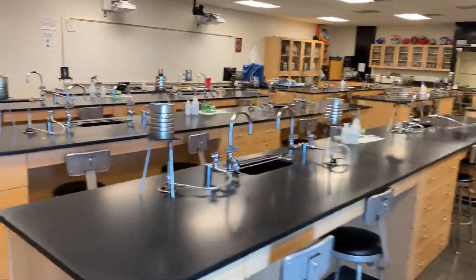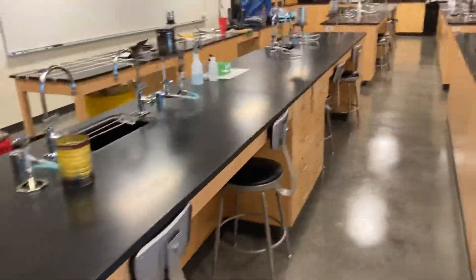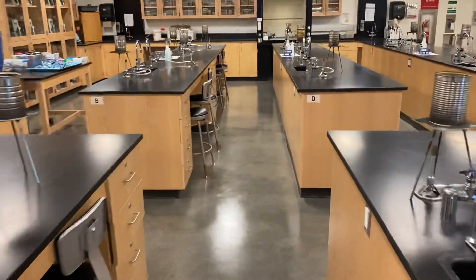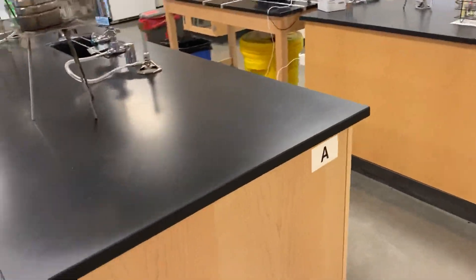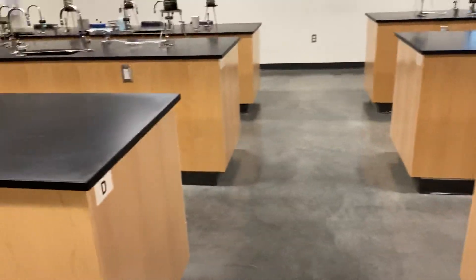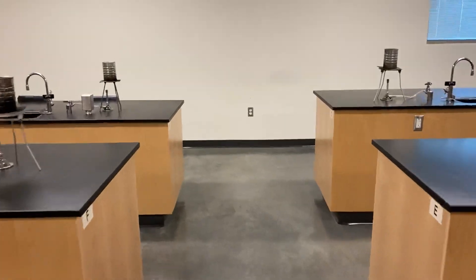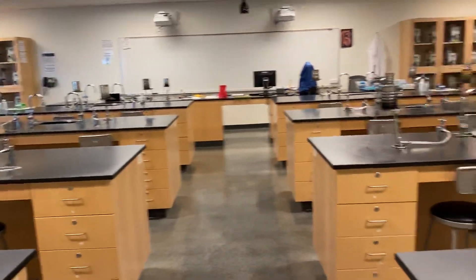We have a full set of eight benches. You'll learn how to identify them, starting with A right here. They're all labeled through the center — there's B, there's A where we just started, and then we have C, D, and so on and so forth, for a grand total of eight benches. We will only have one student per bench, maintaining social distancing rules.